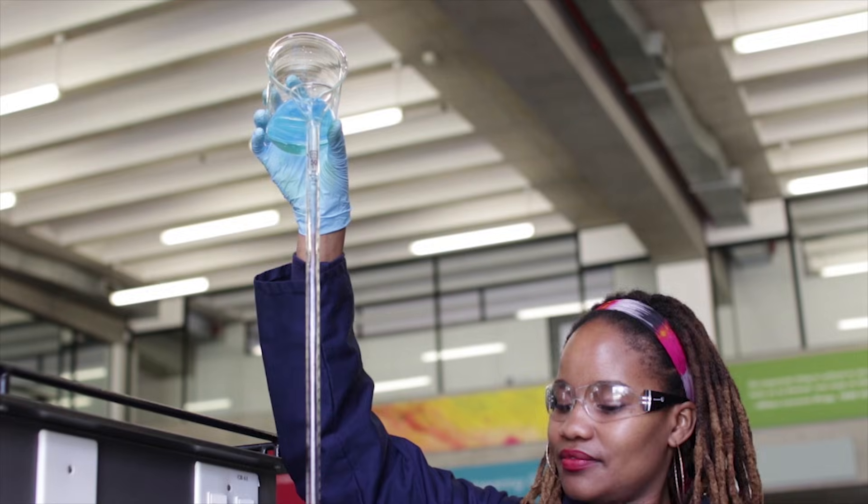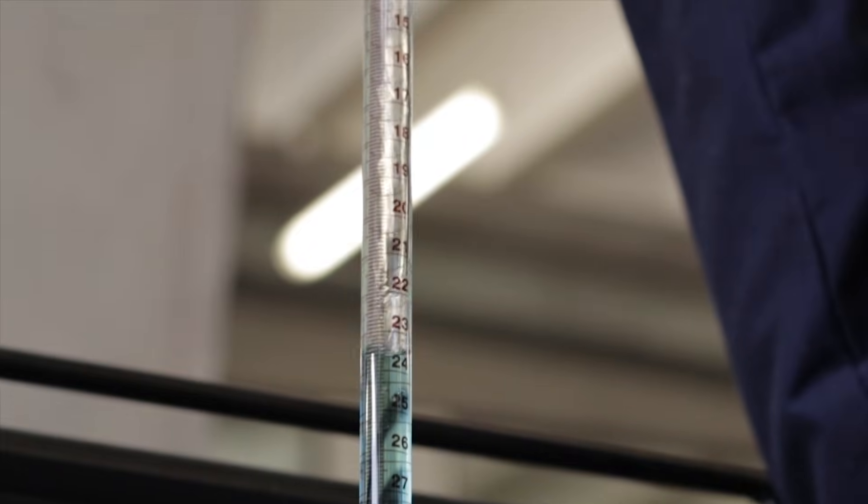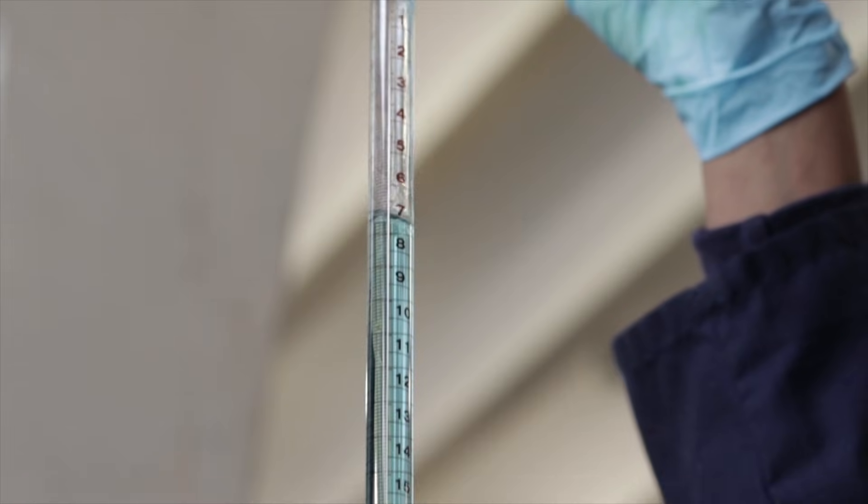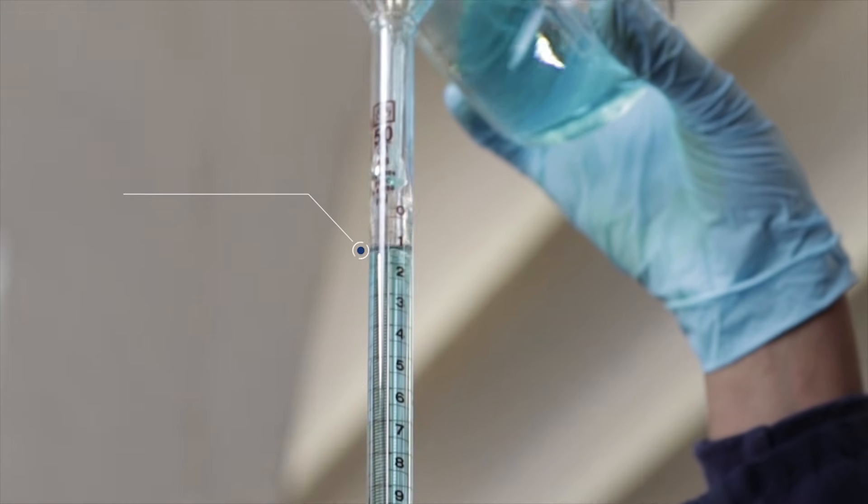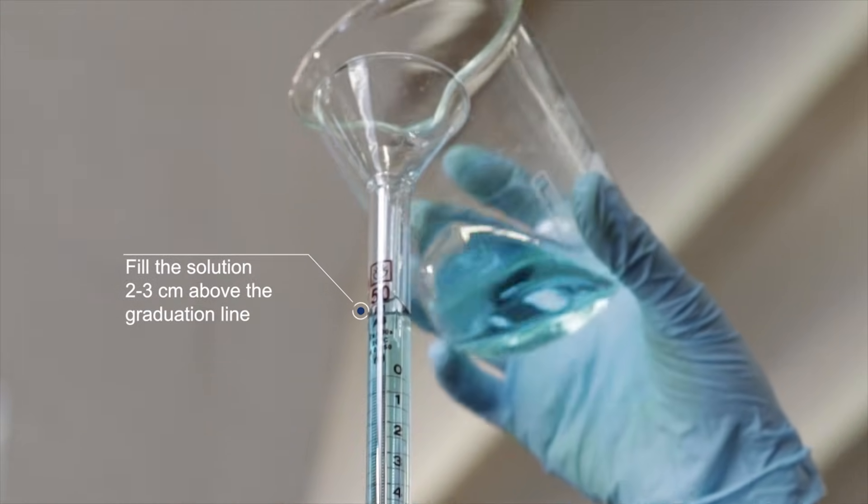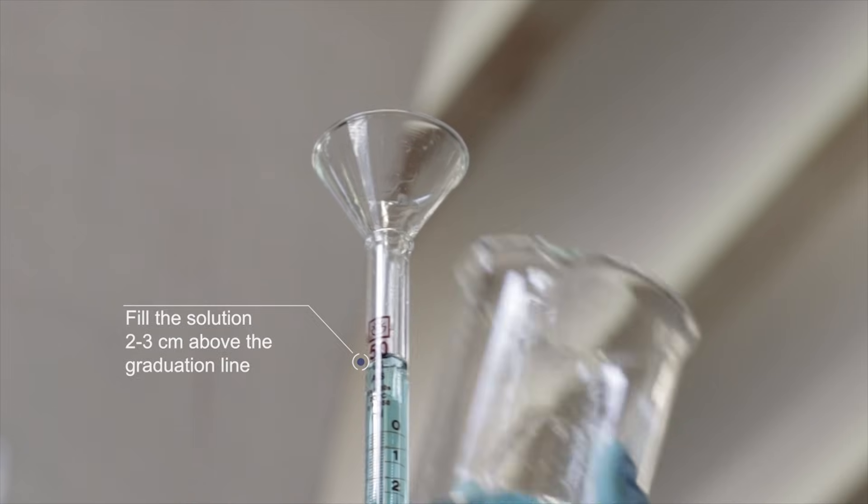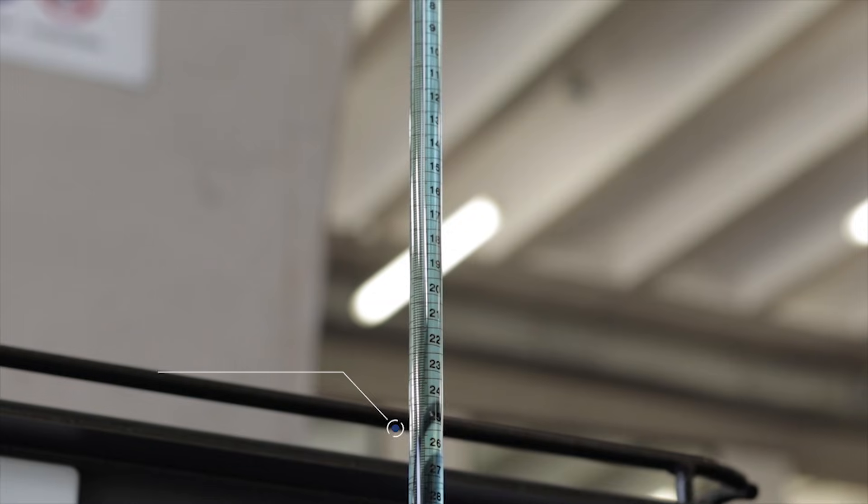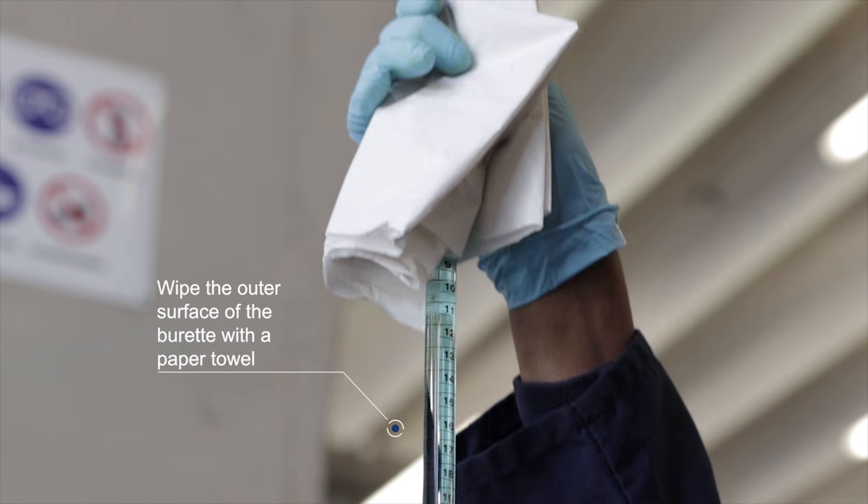The solution is poured into the burette using a small beaker up until the burette is filled two to three centimeters above the zero graduation line. Once the burette has been filled always take the funnel out of the burette and wipe the outer surface of the burette with a paper towel.